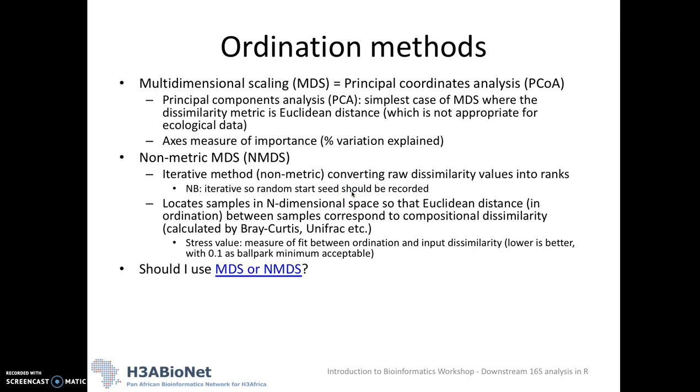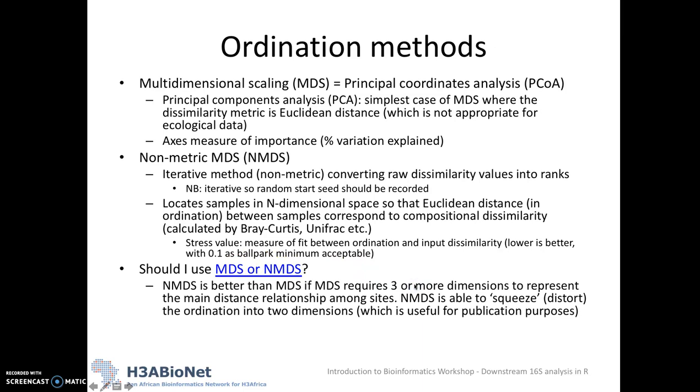So now the question is, when do you use MDS and when do you use NMDS? And for that, you can do some additional reading here if you follow this link. But basically, I like to do both of them on my data and see how much they differ. Ideally, they should look similar. You want to see the same kind of patterns between MDS and NMDS.